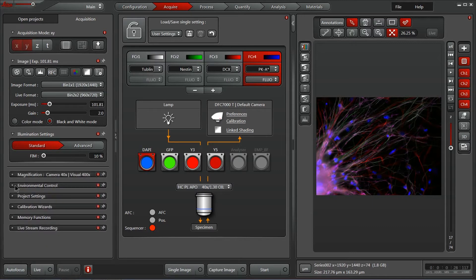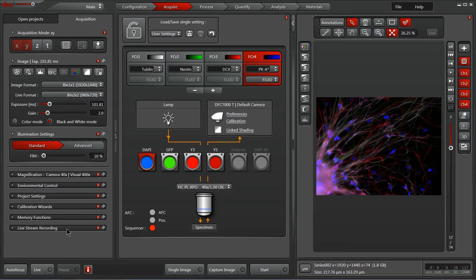We also have access to environmental controls, project settings, a calibration wizard, memory functions, and the ability to do a live stream recording directly here within the acquisition tab.